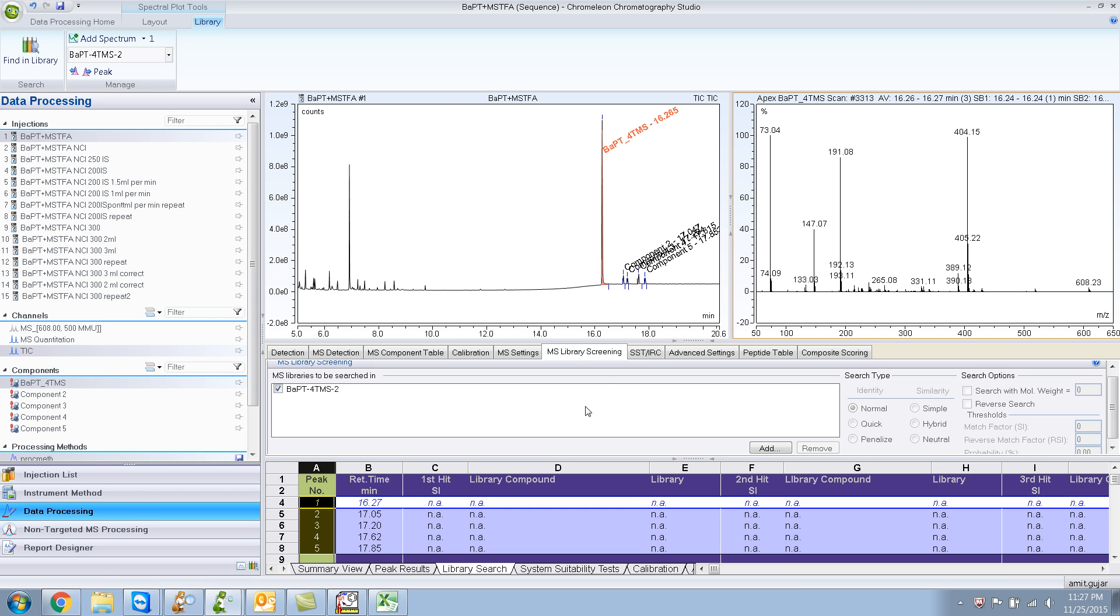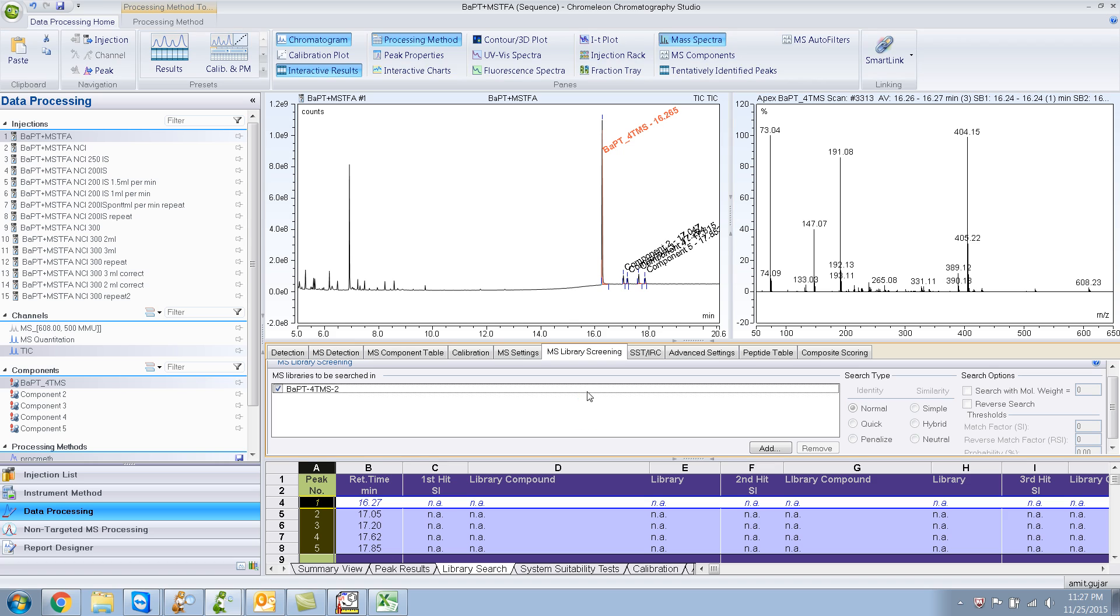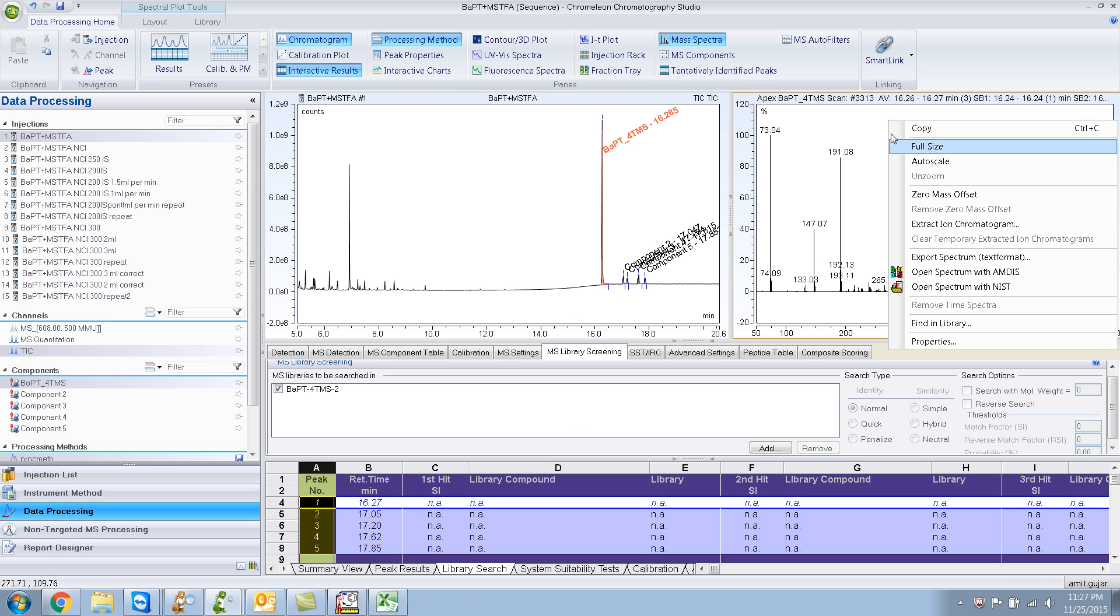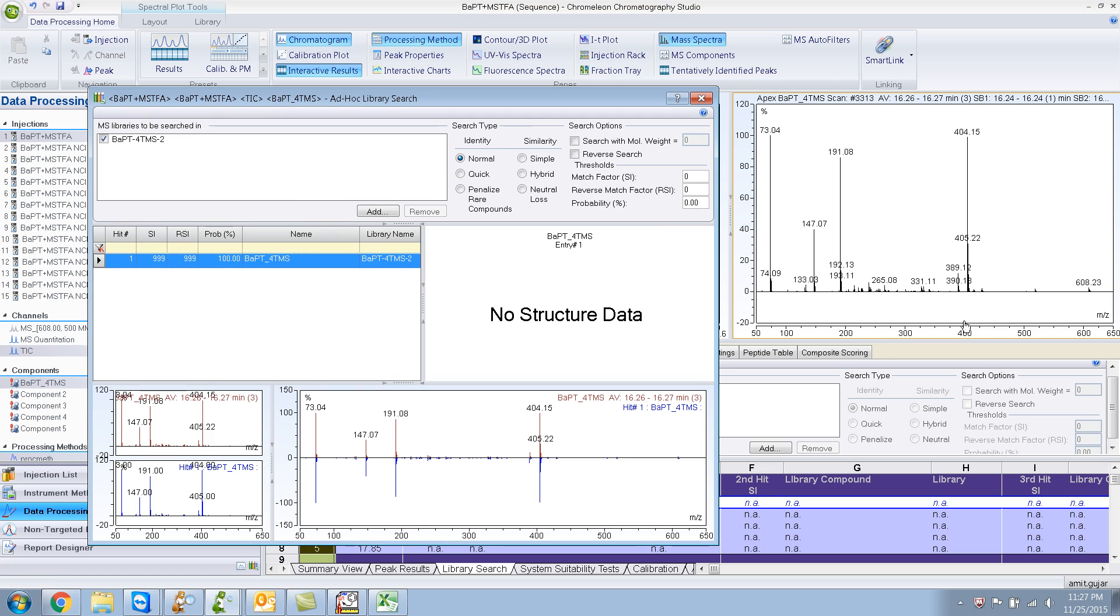And now if I do a library search, hopefully you will find it. There you go. See, 999999, 100% because that's the only thing that's in the library so it gives me a perfect match.